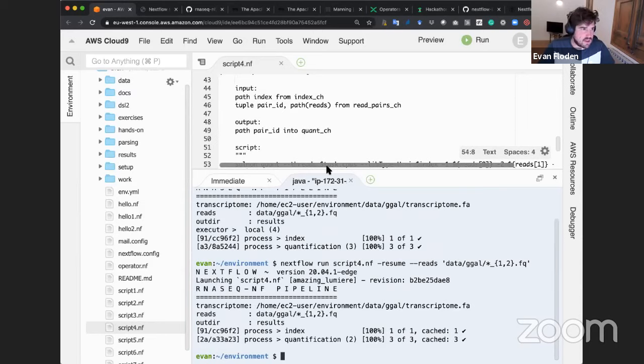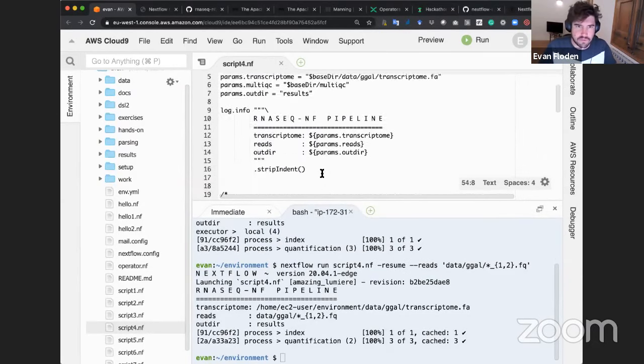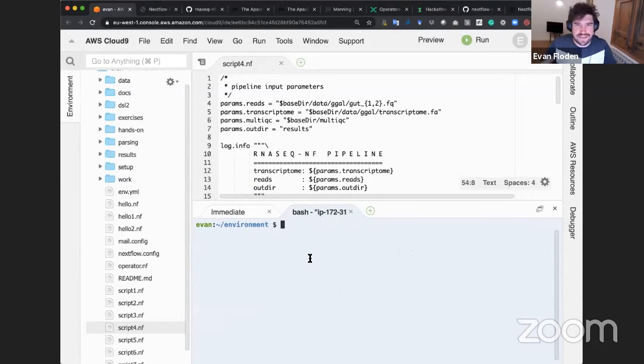Yeah, there's a whole lot of reading you can do on this. There are some blog posts on the Nextflow website, because something like 8 or 10 different things are considered when you run a resume on a pipeline, and there are various options available for changing the leniency of that resume function.